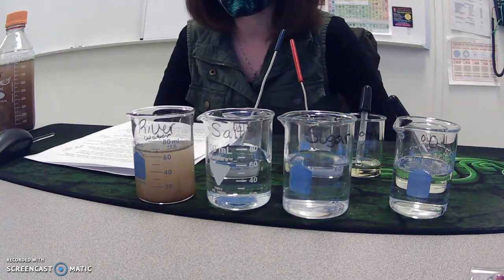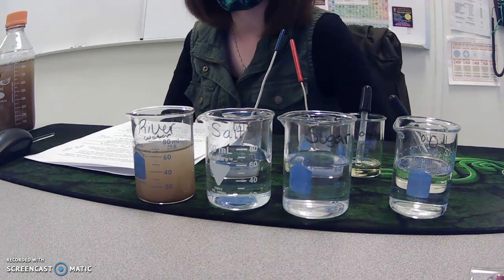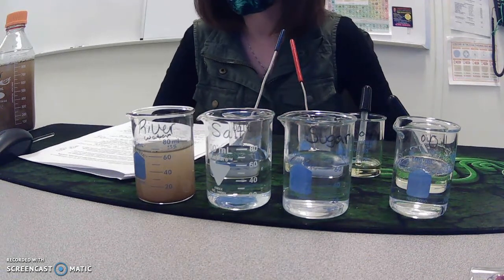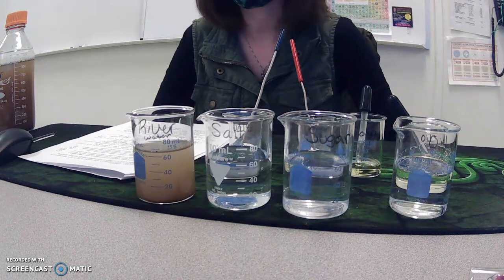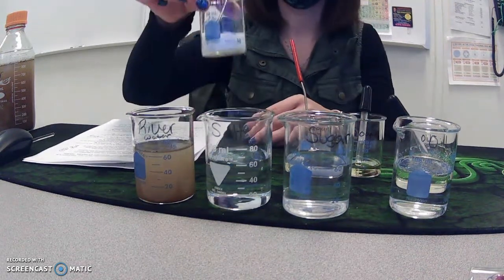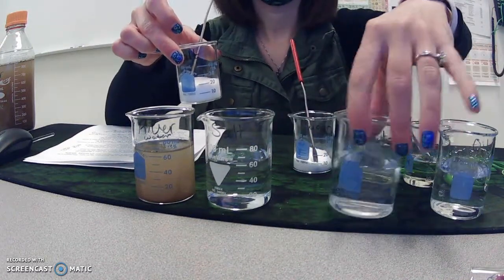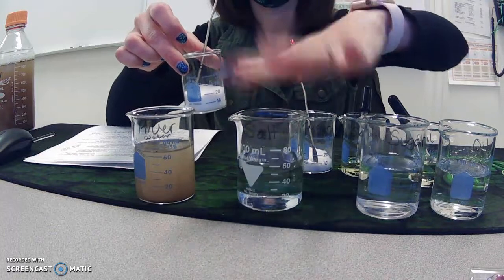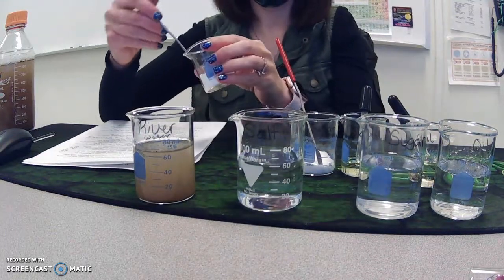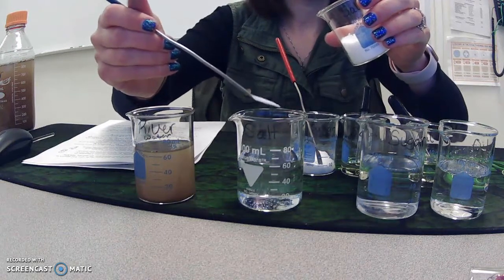Next, we're going to test an ionic compound. Add a scoop of sodium chloride to the third beaker and stir the water. What happens to the salt? Is the salt soluble or insoluble in water? So here we have our salt. We're going to add our salt to our third beaker of water. Going to add a scoop of salt.